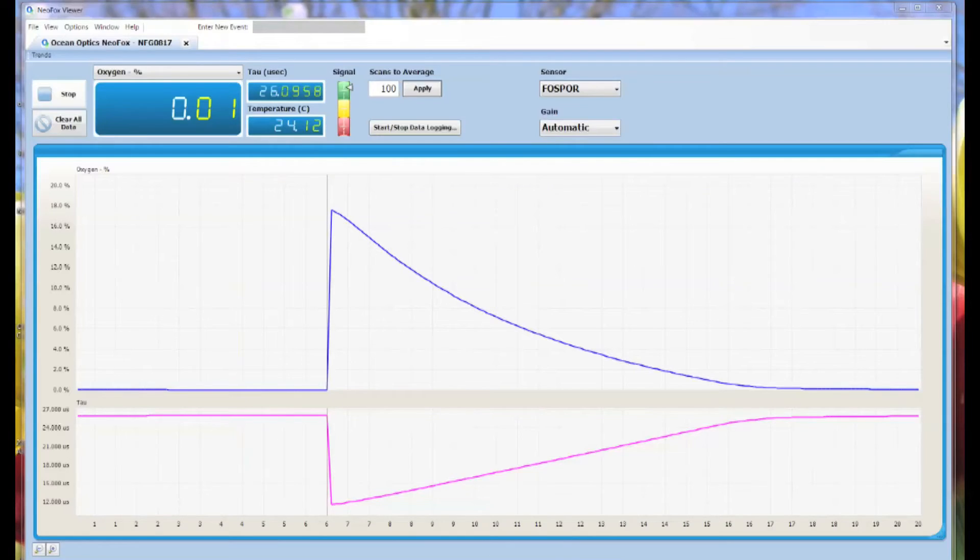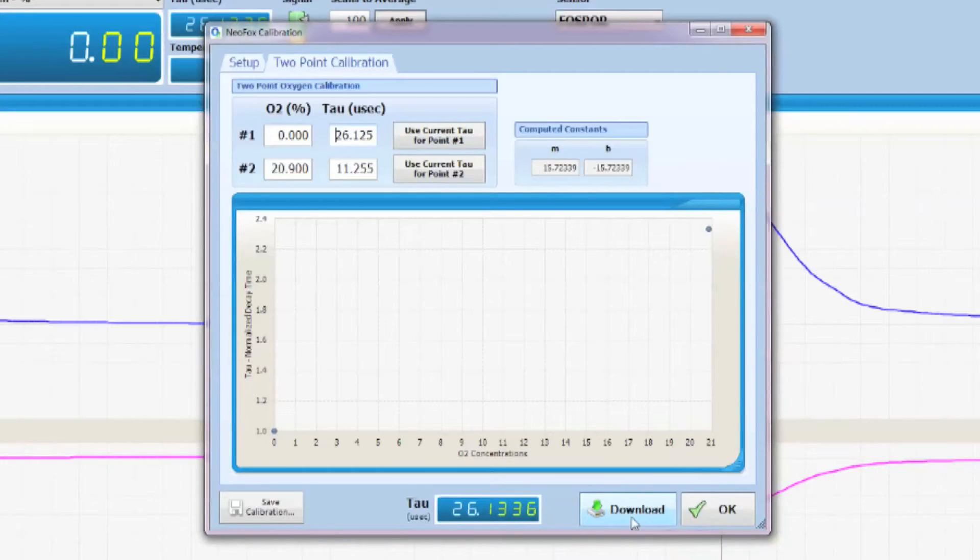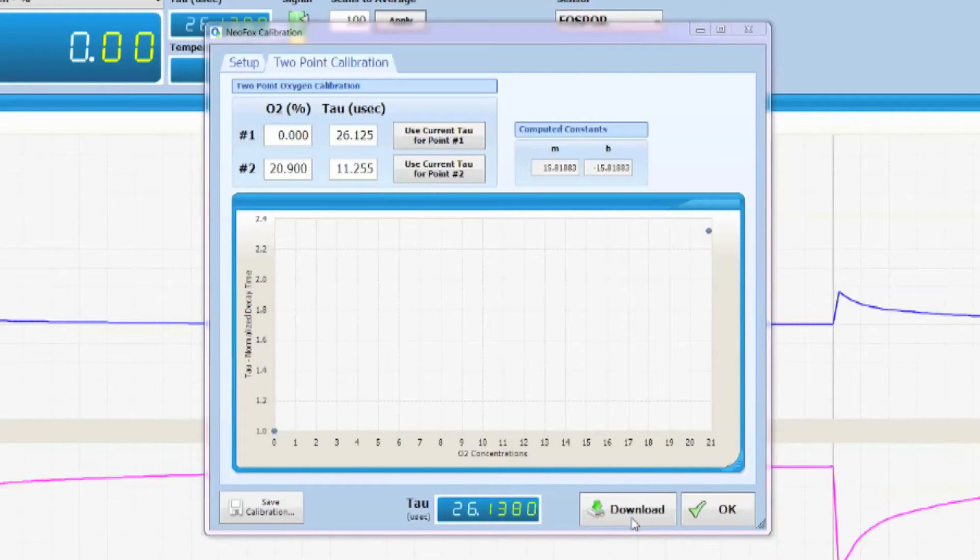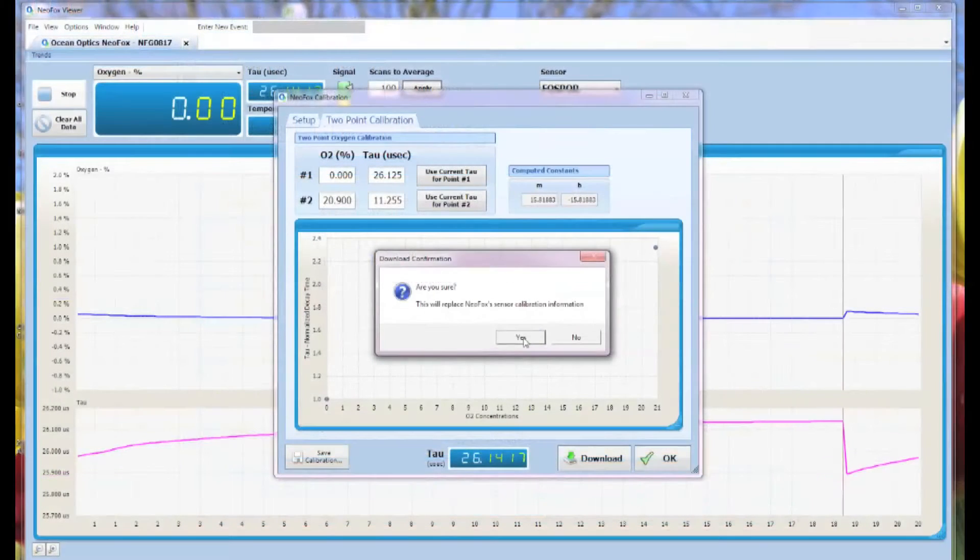Once you see your signal stabilize, you'll click use current tau for point one. Once you've got your two calibration points, you can click download in the lower right-hand corner. There will be a confirmation box asking if you're sure you want to do this because it will erase some of the presets from the factory. Click yes to continue.